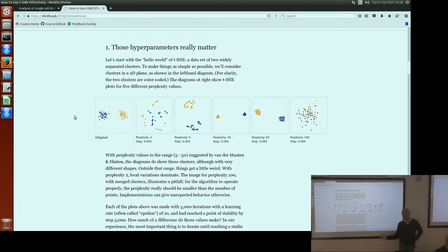it's in the papers. Sometimes you can do clustering of the cells separately from t-SNE, and then visualize your clustering using t-SNE. Actually that makes sense, because sometimes t-SNE can separate exactly the clusters that you identified, whereas PCA would not do that. So for visualizing your clustering, it's a good way to do it. But you have to make sure that your clustering is not based on t-SNE dimensionality reduction, right?